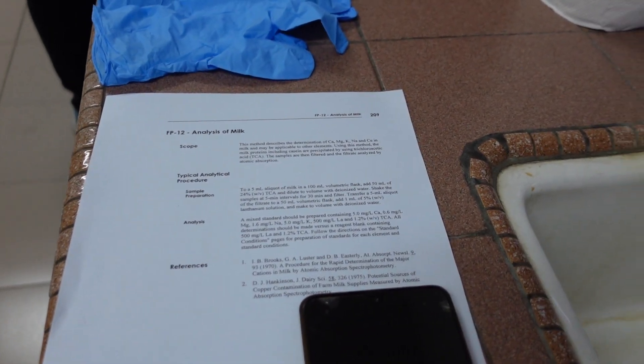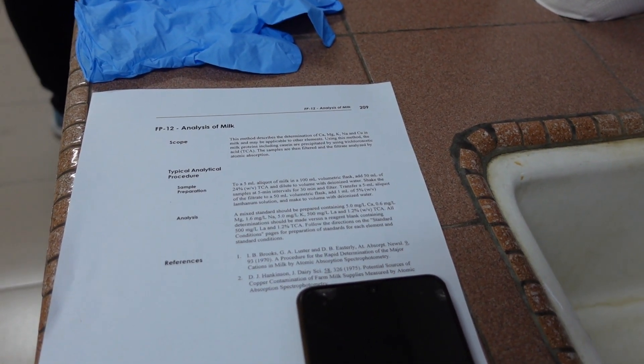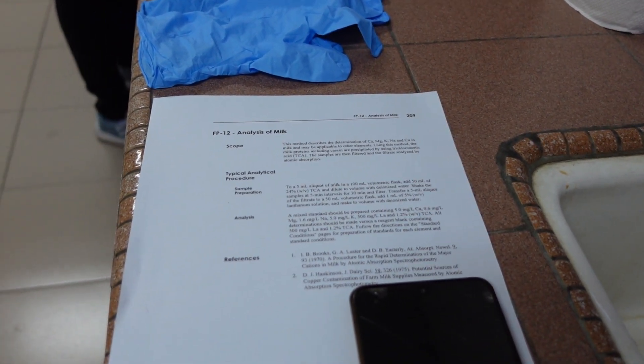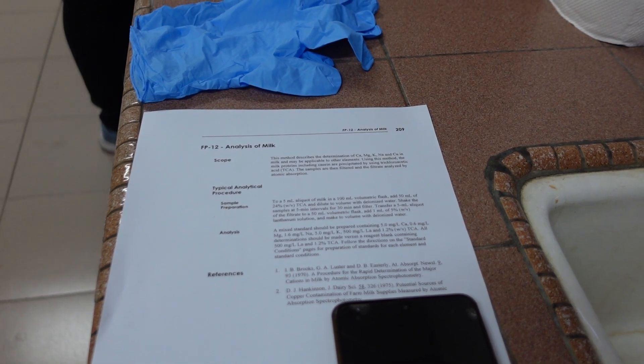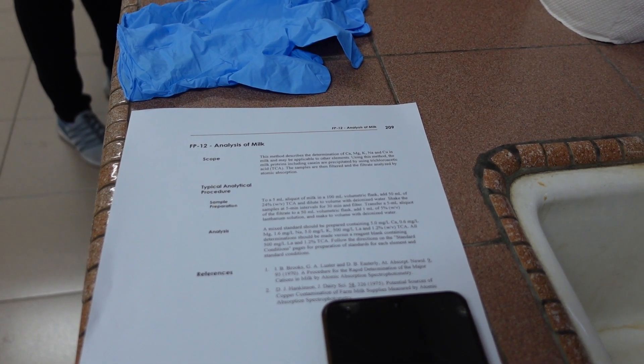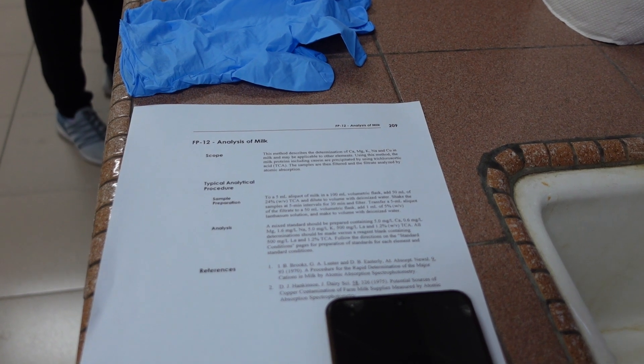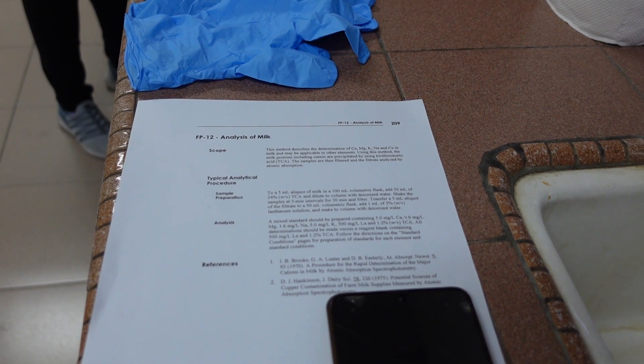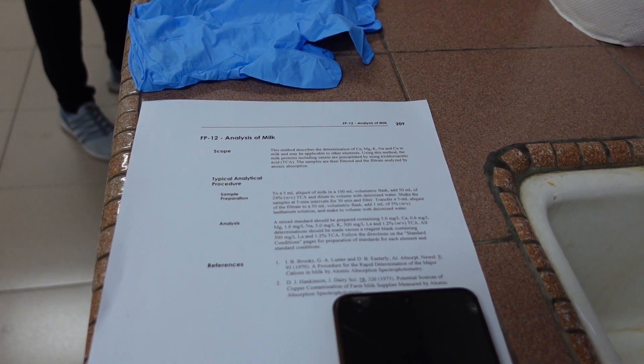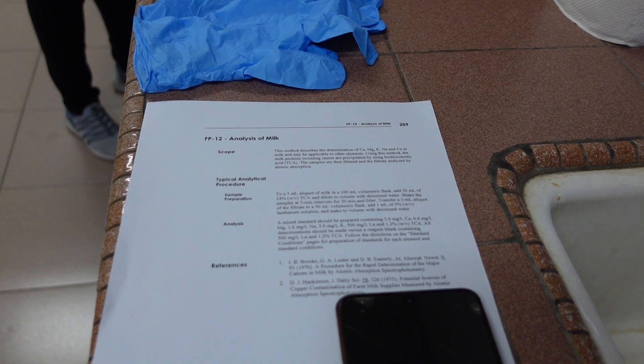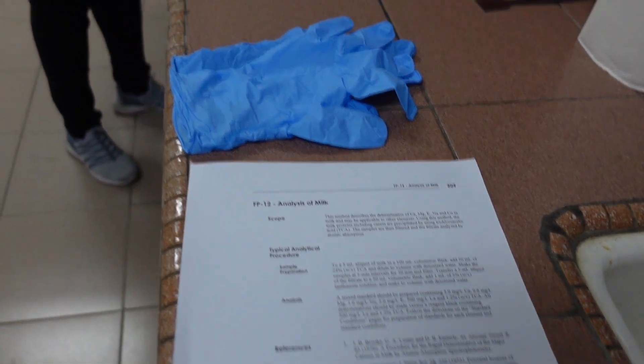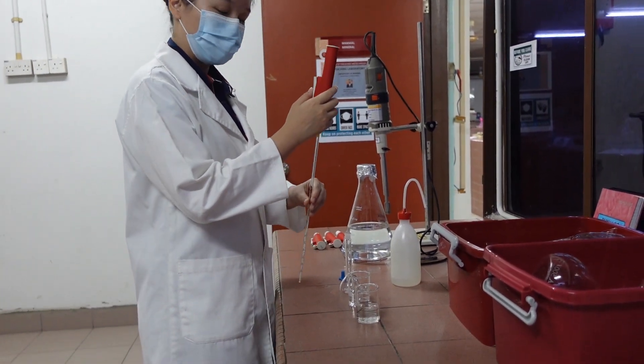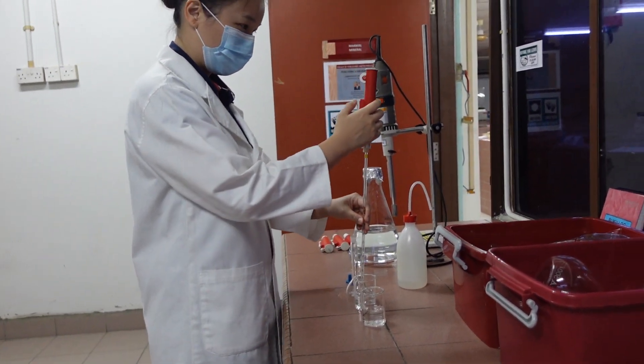Step number one is sample prep. To run AAS, what you need to do first is prepare the standard. You need to prepare the standard of a known concentration. In our case today, we are going to do a calcium standard. We're going to prepare a series of different concentrations of calcium.